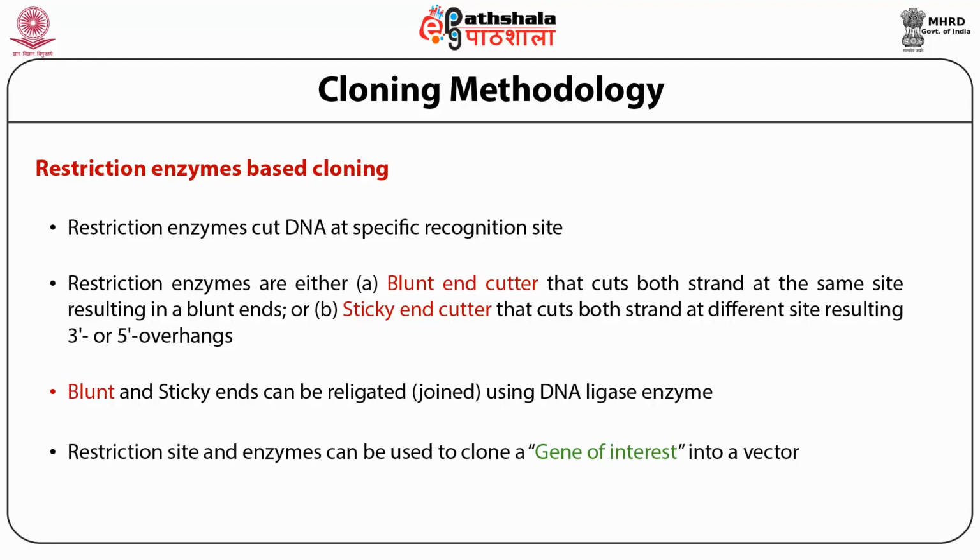Restriction enzymes cut site in your gene of interest as well as in your vector should be unique. It means that your desired restriction enzyme cut site should not be present in the gene of interest, otherwise while digesting or preparing your vector as well as insert for cloning could result in multiple bands.